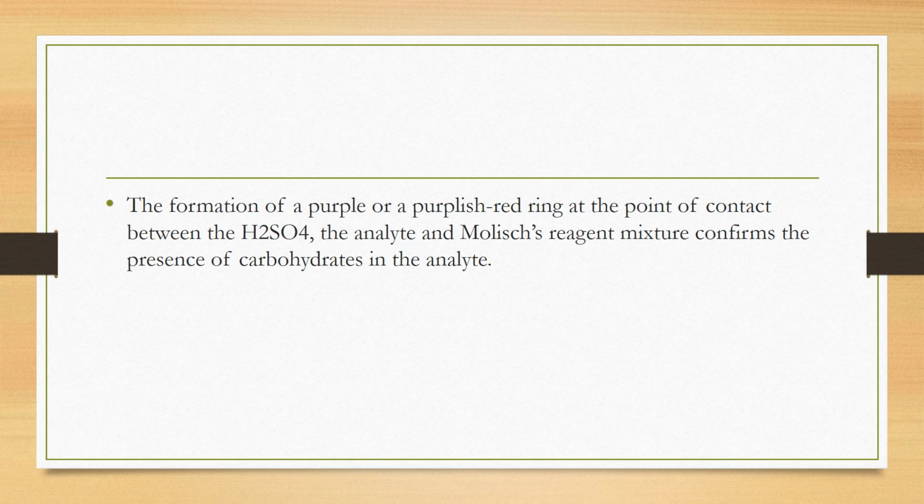That confirms the presence of carbohydrate in the sample.